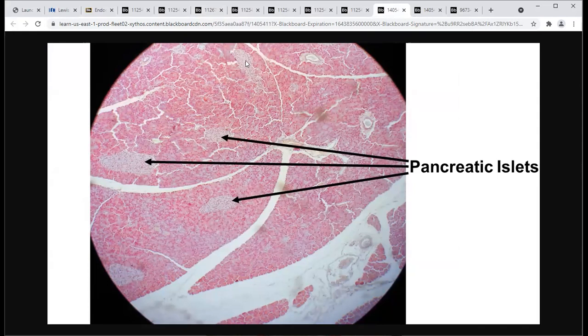here, but there are others. These are more gray in appearance. They are in the business of making insulin and glucagon. So when you look in your lab report, or you're writing this in your lab report, or look in the lab manual, the first hormone in the lab manual is insulin.